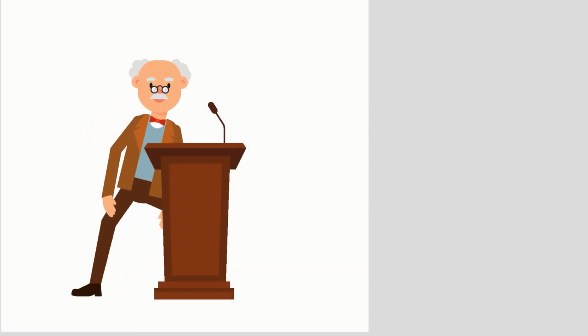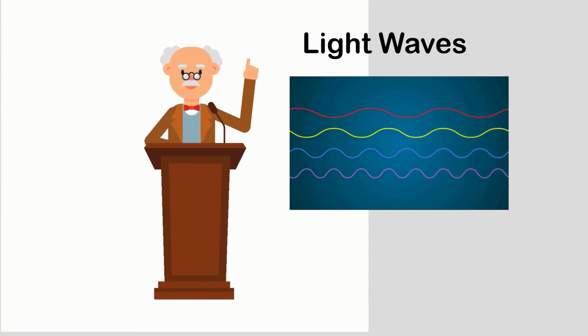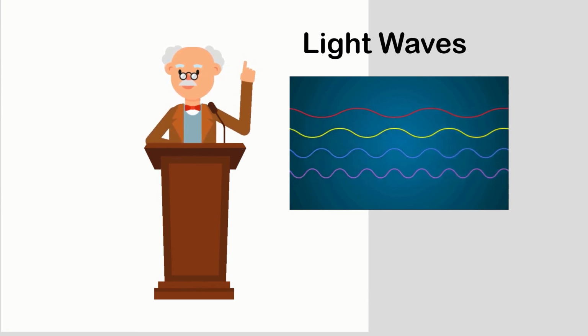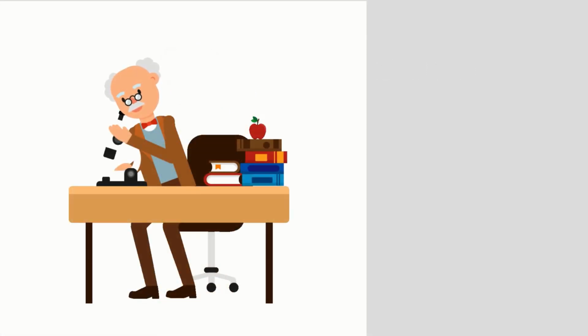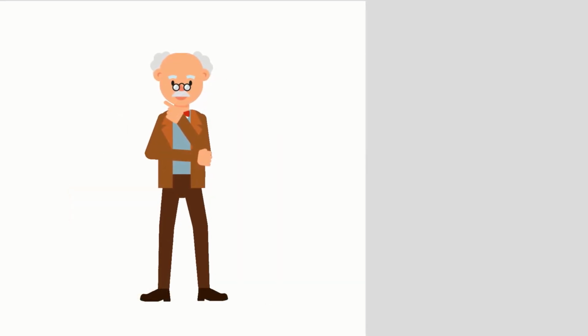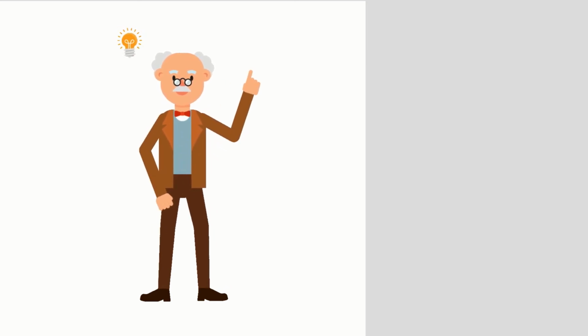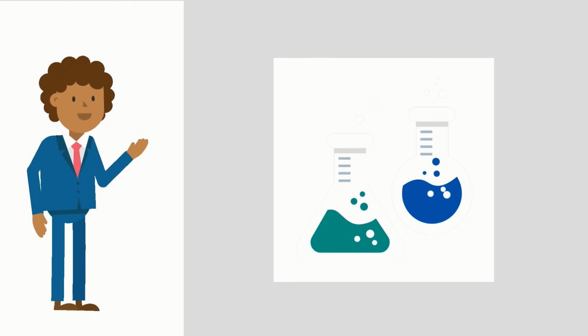Light microscopes are limited by the wavelength of light used to probe the sample. So at best, optical resolution is about 200 nanometers, which will get you in the ballpark of nano, but it's orders of magnitude away from seeing actual atoms. But don't despair. Scientists have developed instruments to surpass these limits. I will briefly go over a few instruments that we use in our lab.